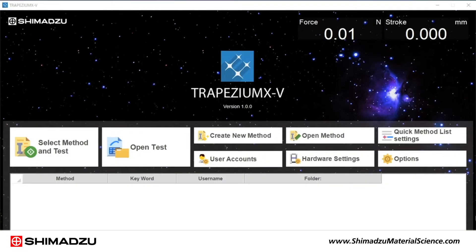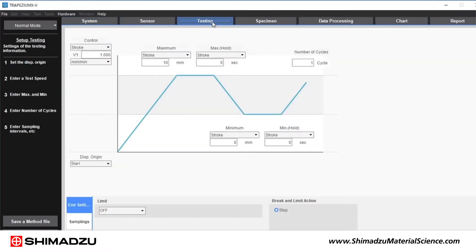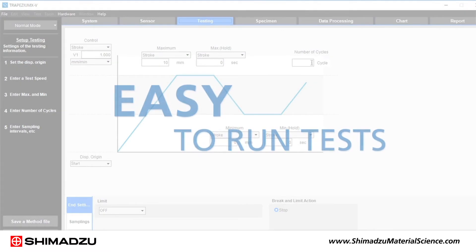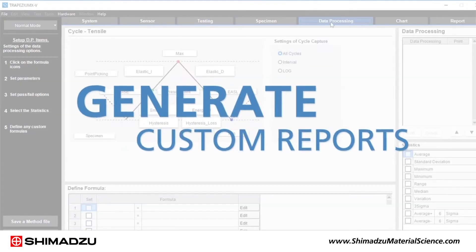That's why Shimazu developed the Trapezium XV materials testing software. It features an intuitive user interface that makes it easy to run tests, analyze your data and generate custom reports.